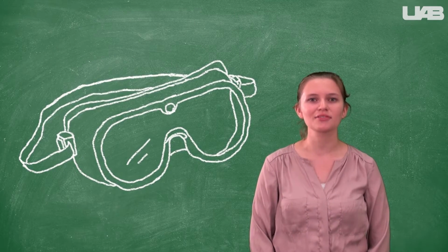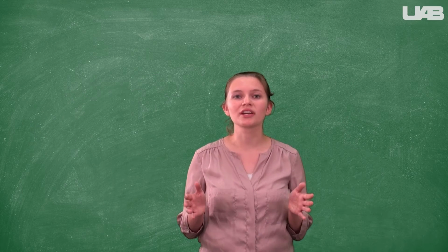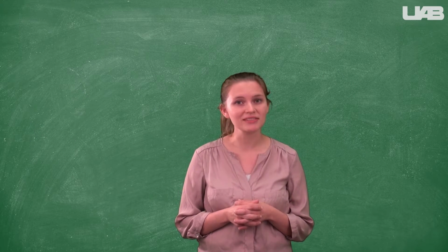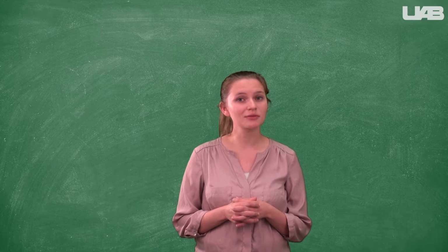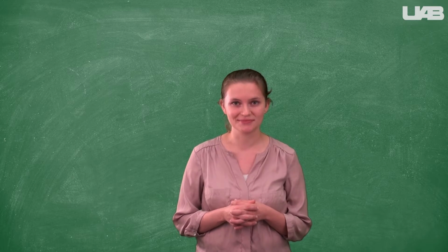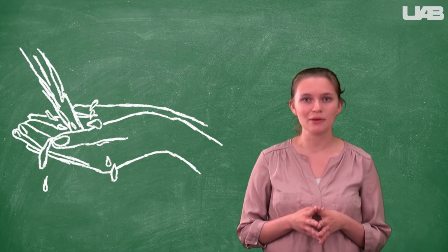As usual, you have to wear your goggles anytime chemicals are out. We are working with concentrated ammonia, which is a base with a pungent odor, so it must stay in the fume hood. Everyone in the room will know if you bring any back to your bench, so don't take it out of the hood. If you spill anything on your skin, make sure to flush it thoroughly with water.